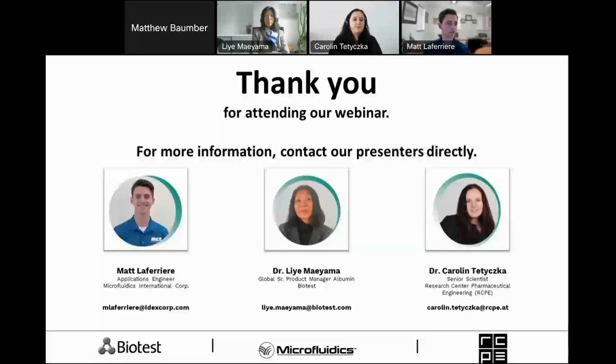Thank you. And then lastly, we have one more question that reads, which was the efficiency of conversion of HSA to HSA NP? Did you measure the residual monomeric polymeric HSA? The encapsulation efficiency was 98% with a loading capacity of 9%. And regarding the second one, we measured the particle size, and there we saw that we only had one size fraction. In comparison to the blank nanoparticles, where we also saw size fractions of monomer and dimer, we did not see it here in the paclitaxel formulation.